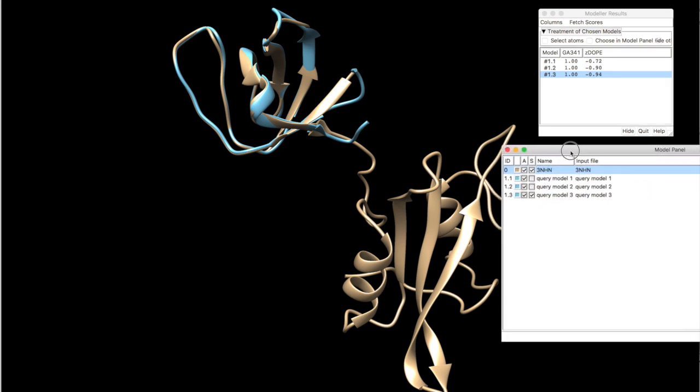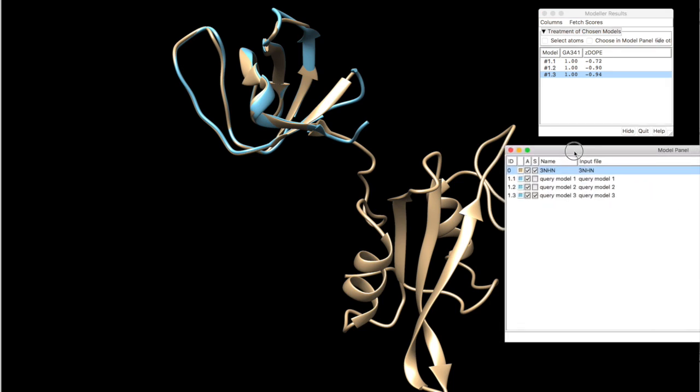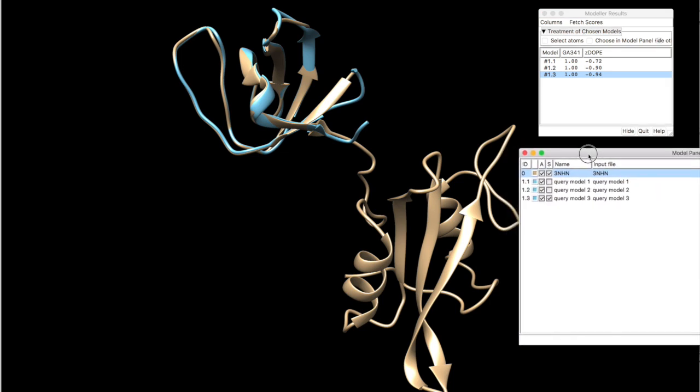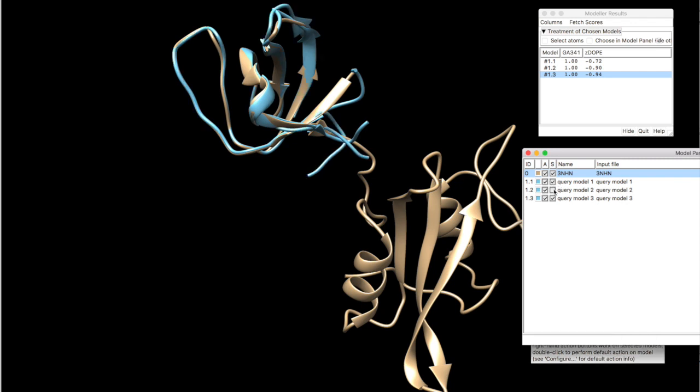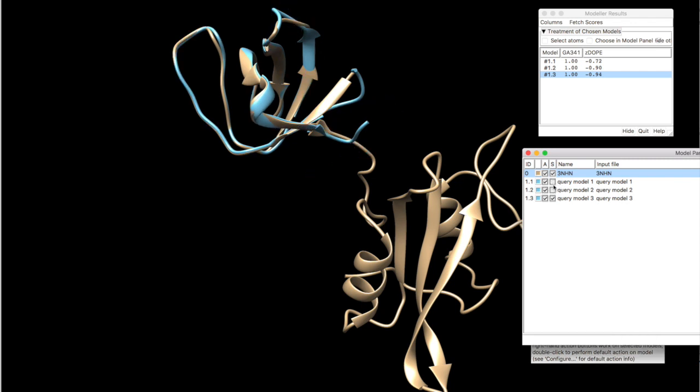Now, you will see that in your model panel window, the models have appeared here. And you can basically see all of them at the same time. You can color them.